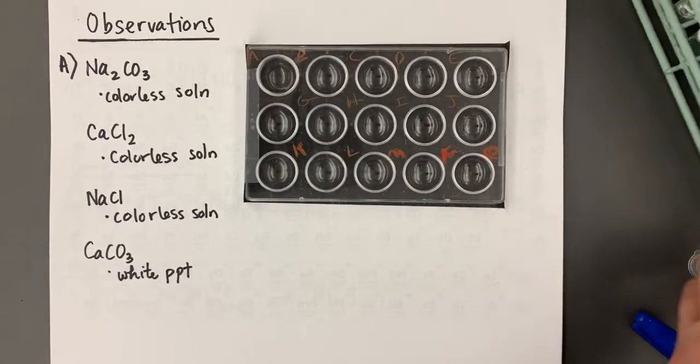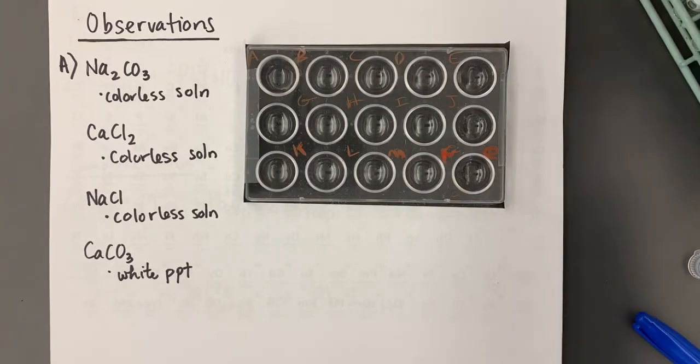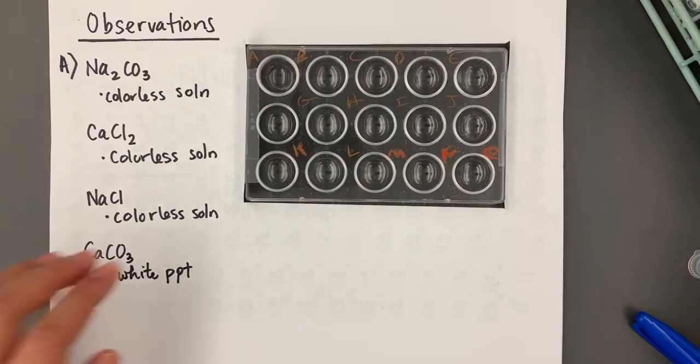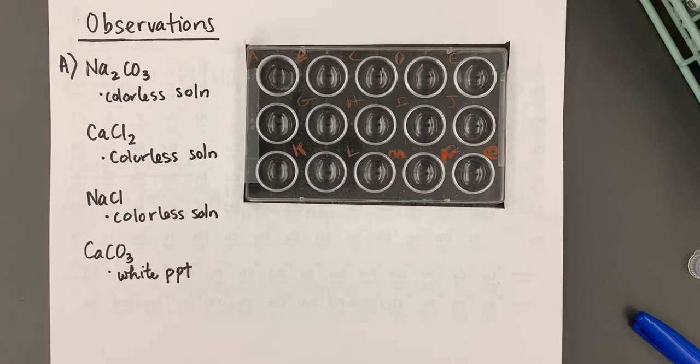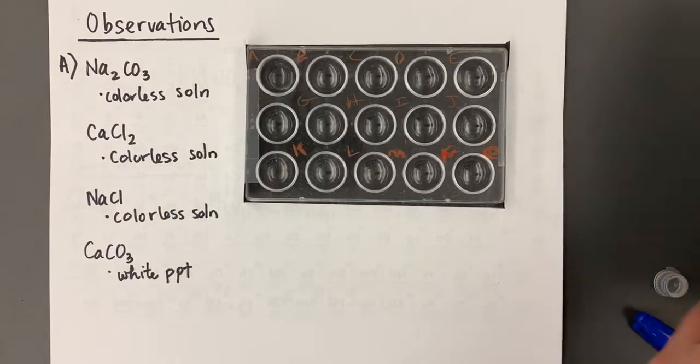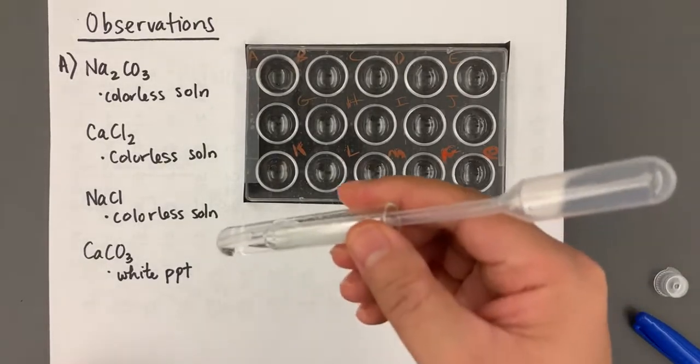Which I cannot find. Calcium carbonate. Calcium chloride. Sorry, I'm adding calcium chloride, not calcium carbonate. Take that back. Calcium chloride, that's why I can't find it. Calcium chloride is here. Sorry, it took me so long.